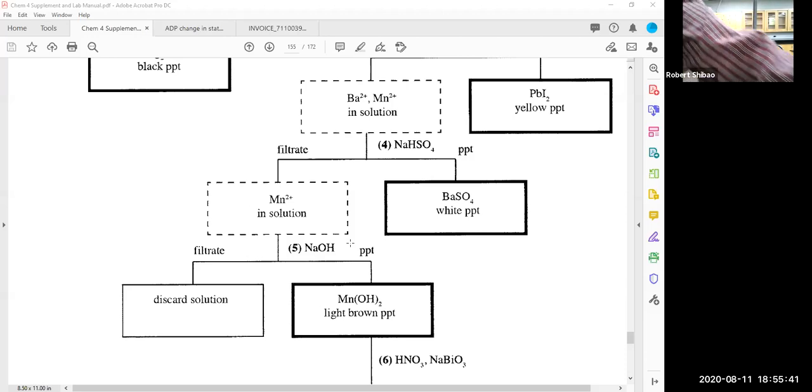And the cation was, let's take a look at the precipitate here. Yeah, it didn't really turn black or brown. There is some discoloration to it, but it could just be discoloration. And so it looks like this unknown only contained lead ions, lead and nitrate ions. So that was that. All right, so this is going to go in the waste. That had some lead in there.